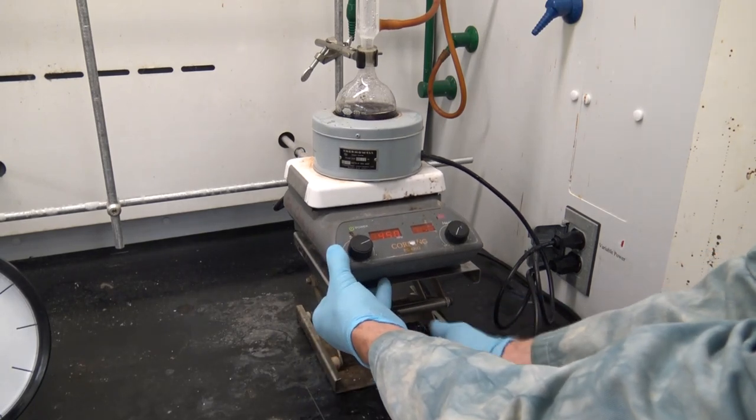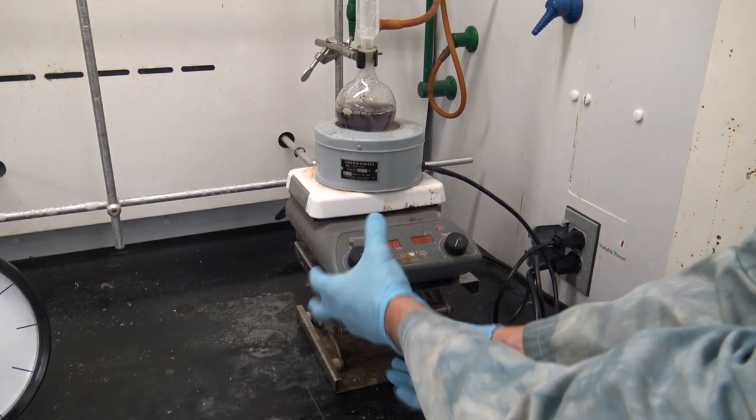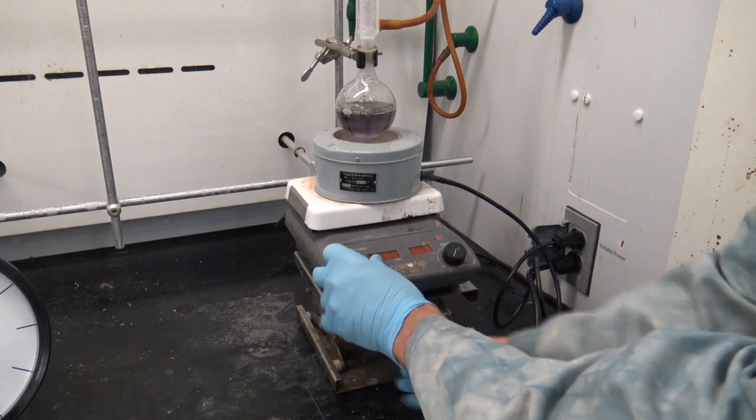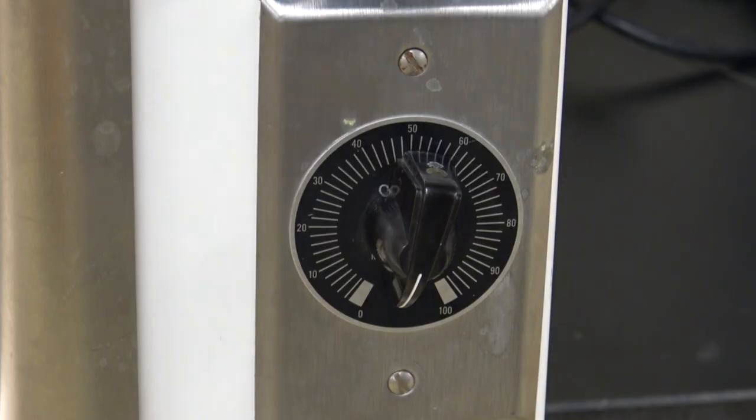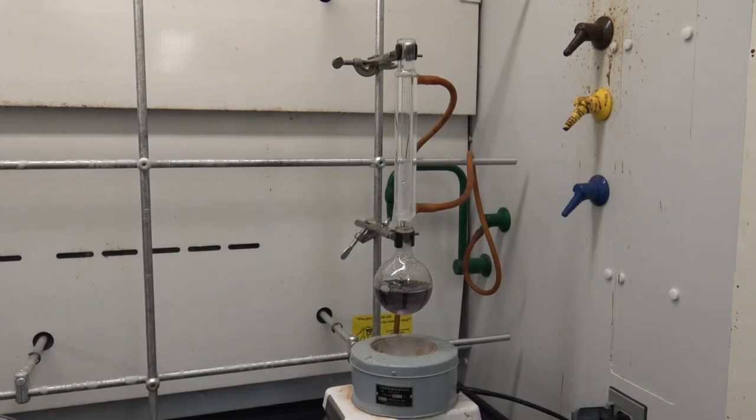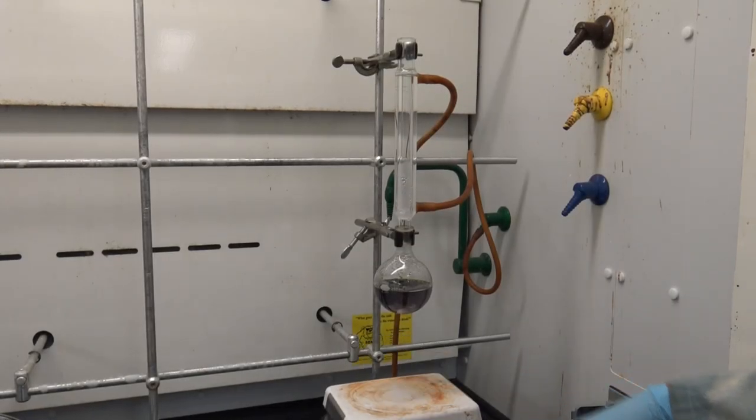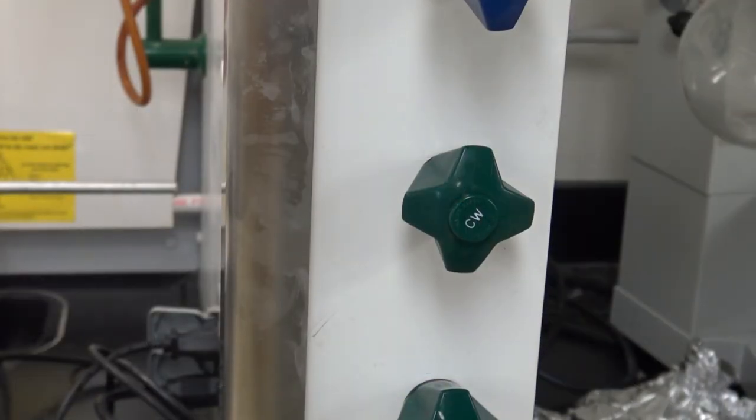To prove this, I'm going to remove my heat source by first lowering my lab jack, and then deactivating my thermal well by turning off the Variac. Once things are cool, I can remove that heat source, and then recover my sample.